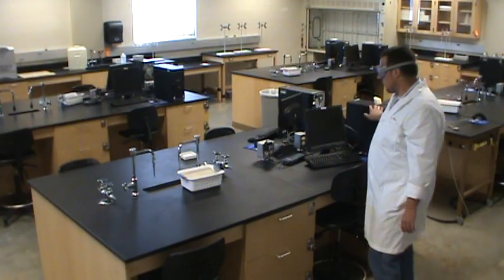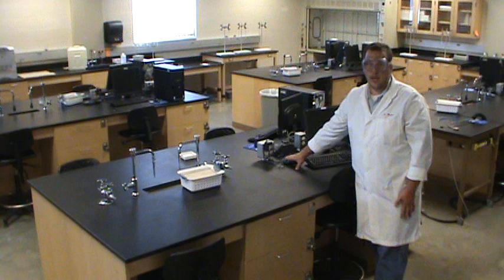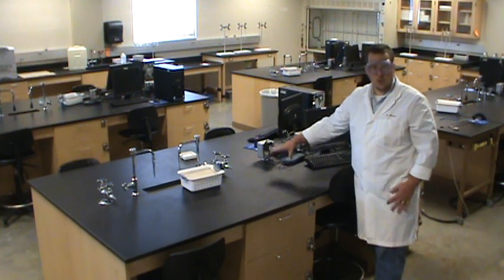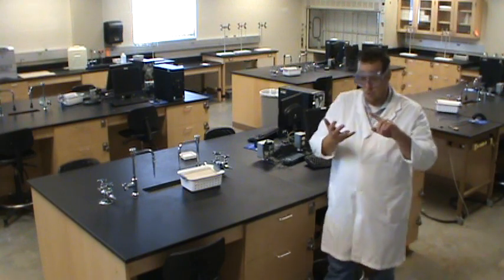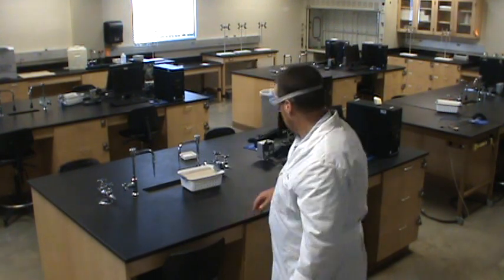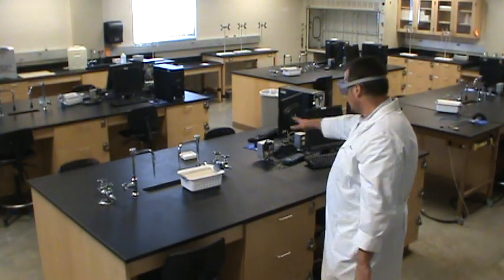Each station also has a computer with a LabPro interface. LabPro is the interface that we use to connect all of our measuring devices, our temperature probes, our conductivity meters, and all the other things that we're going to use to take measurements in the lab. That's what's available at your spot. At various times, other things will show up here when you need them for a specific experiment.